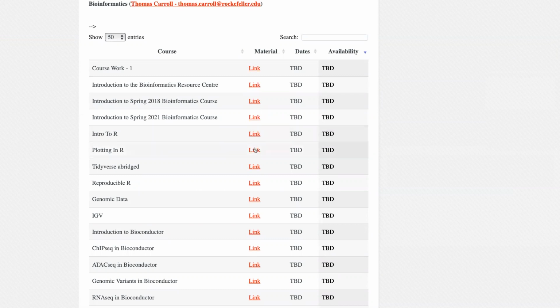We've done our plotting in R, which is mostly ggplot. And I showed you at the end a little bit about how you can mix some of the stuff we learned in reproducible R, effectively build an RMD and R Markdown, read in a table and make a ggplot interactive. We did that at the end of last session in the exercise.